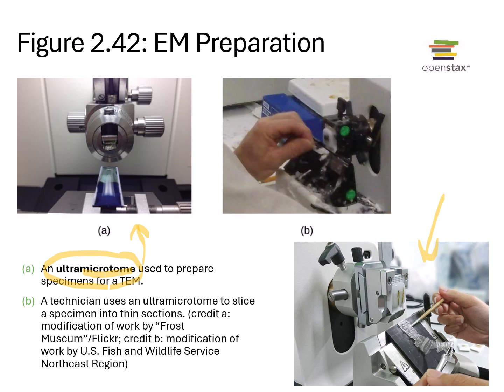Usually what we do, for example, I used this when I was working with brain tissue in undergrad studies. I took brain tissue and embedded it in some kind of wax. Then you use the microtome to make really thin slices so that you can look at them under the scope or do further staining. When we cut these into thin slices, the thickness of each slice is in the units of micrometers, and this allows us to visualize them under a regular light microscope.